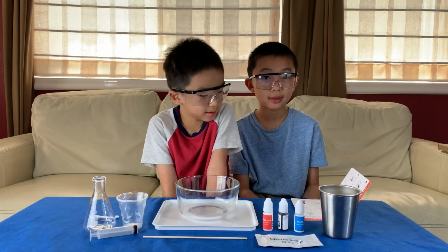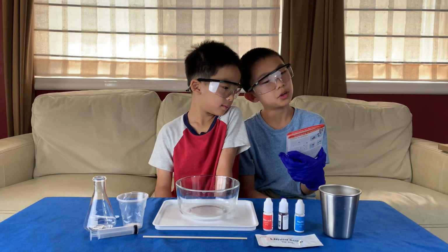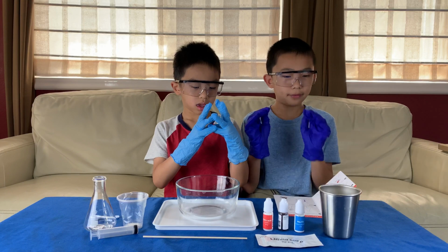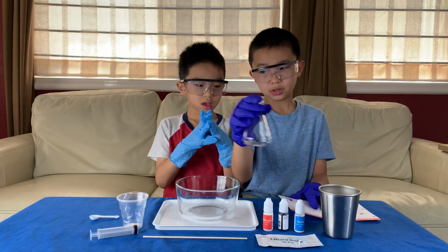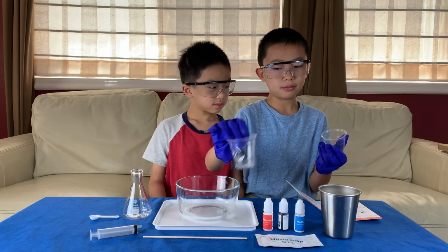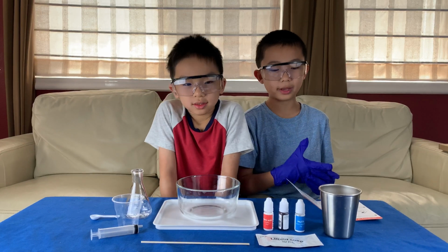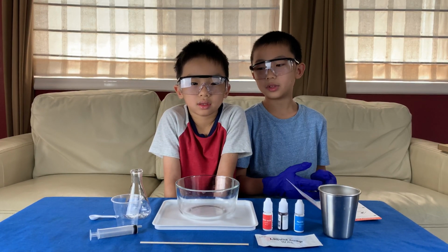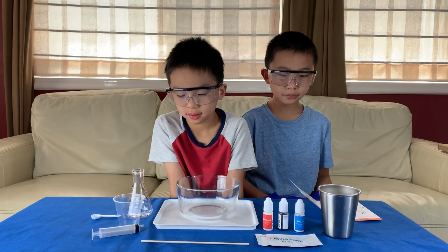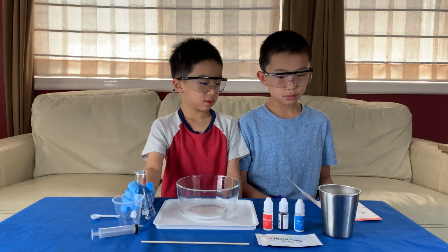Okay, so our first experiment today is the foam eruption, which has difficulty 2 out of 3 and danger 1 out of 3. It takes 15 minutes. So what we have here is the flask from the starter kit, and 2 disposable cups. I think we only need 1. Let's take one. Everything else is fine, I think. Ready?